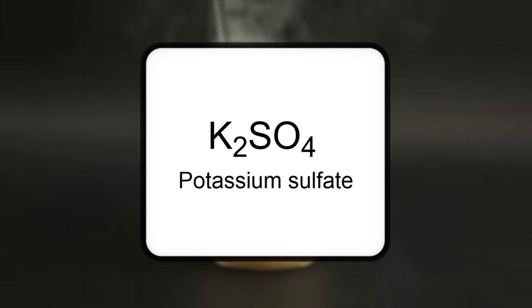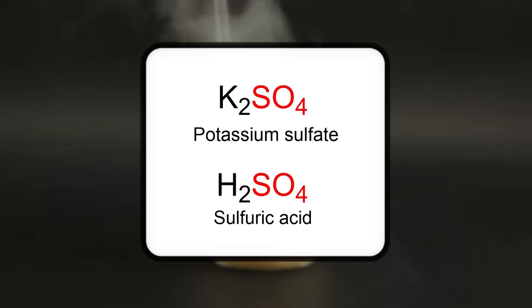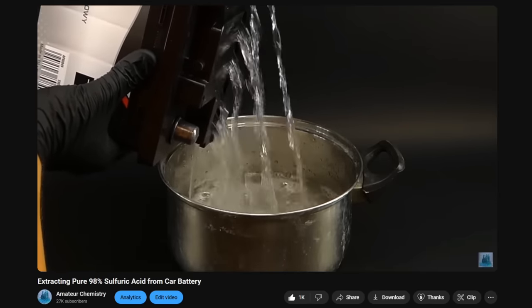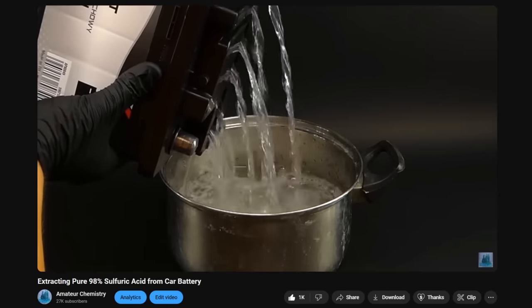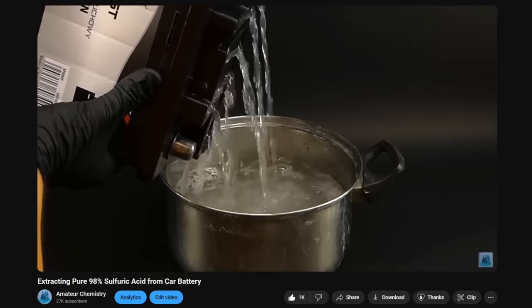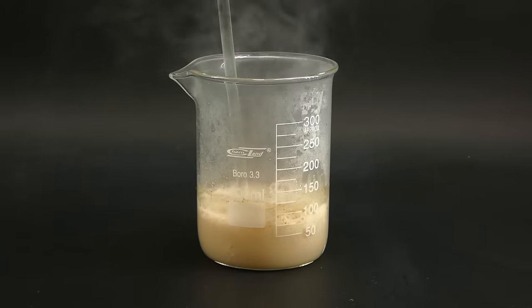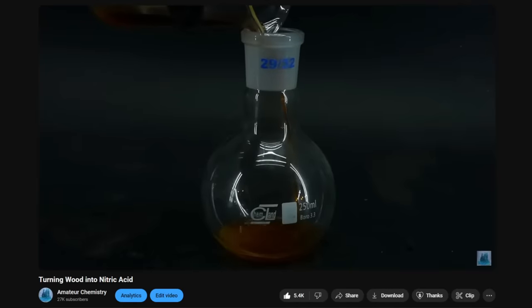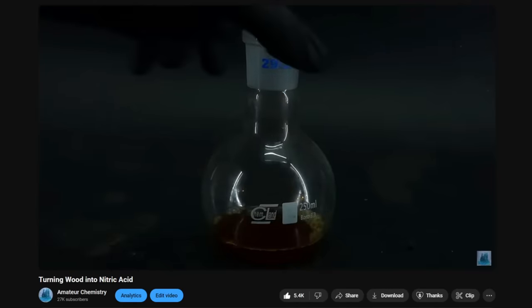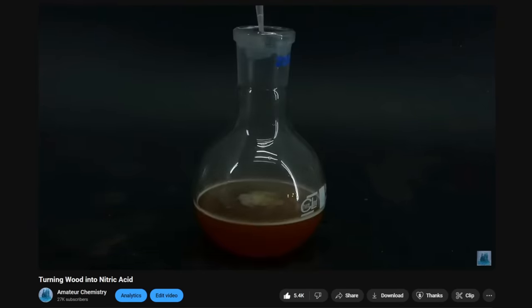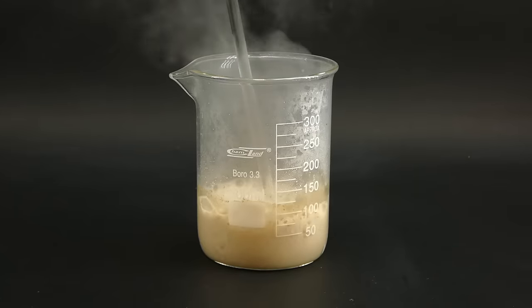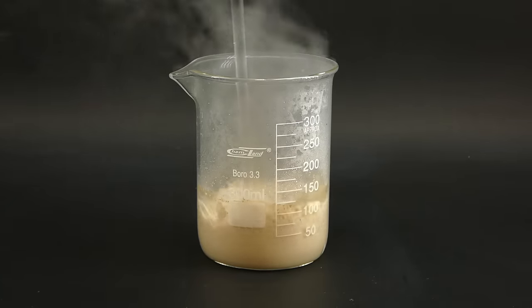Both of them can surprisingly be made from some very basic materials and I decided to first focus on potassium sulfate. I already knew that I could easily get the sulfate part from sulfuric acid, which I extracted from a car battery in a previous video. But when it comes to the potassium I wasn't so sure about how to get it. Fortunately I remember the process I used in my wood to nitric acid video.